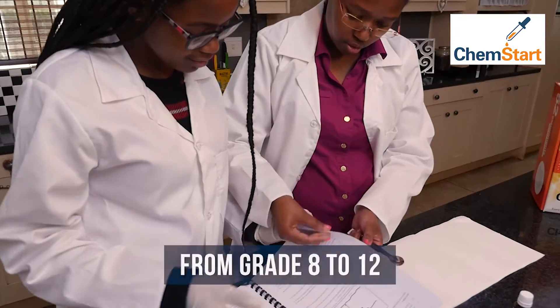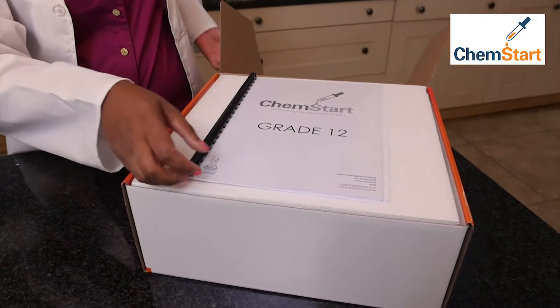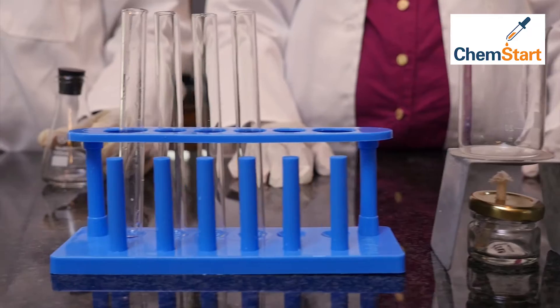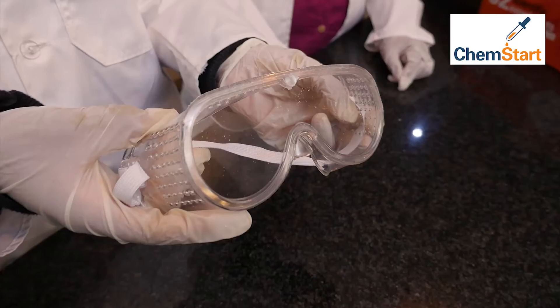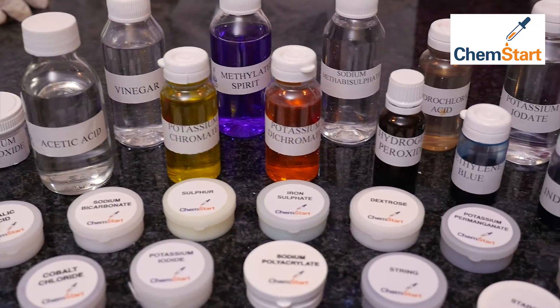Each ChemStart kit has a range of experiments for kids from grade 8 all the way to matric. ChemStart includes basic lab apparatus like beakers, thermometers, flasks, safety goggles and gloves, as well as liquid and solid chemicals.